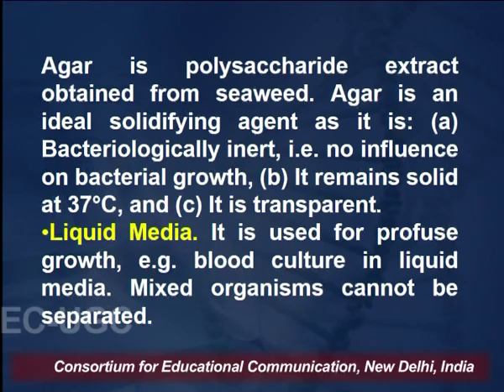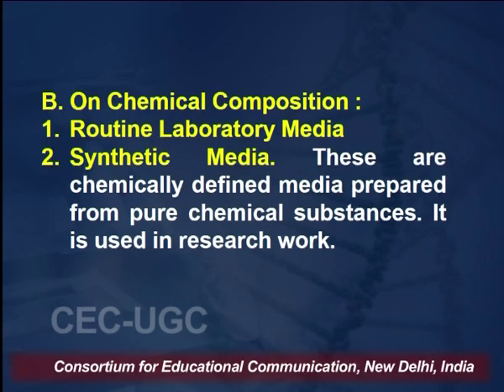The other example is the liquid media. It is used for the profuse growth when you need a large number of cells. Example, blood culture in the liquid media. Mixed organisms cannot be separated. So, this is the disadvantage of the liquid media.